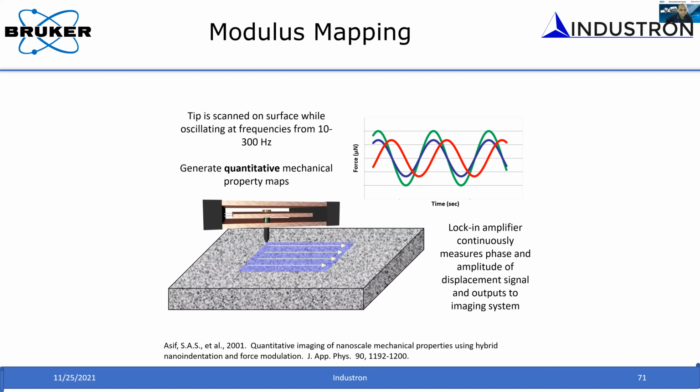The thermal expansion is only 6 nanometers per degree C, and it is a kind of micro chamber. So you have to have that heating stage first, and that's very important. Second, you need a DMA measurement capability in the instrument. If you have both, you can do high temperature creep measurement without any problem.